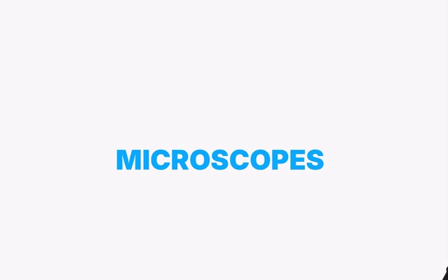Hi everyone. Let us now start with the next topic of general microbiology, and that is the bread and butter of a microbiologist, a pathologist, or anyone sitting in the lab, and that is the world of microscopes. This is exactly why this subject exists, right? So, before I start with the different types, there are certain common features that every microscope has, and the main purpose of the existence of a microscope is its ability of magnification.